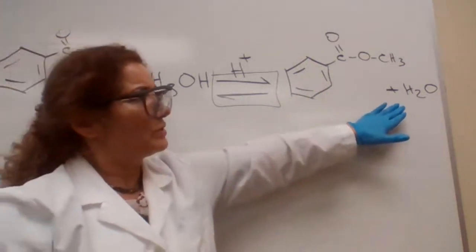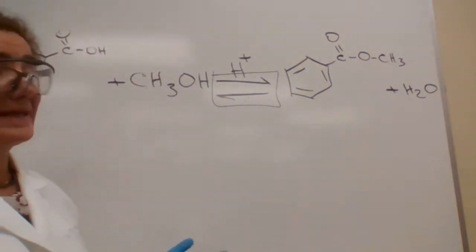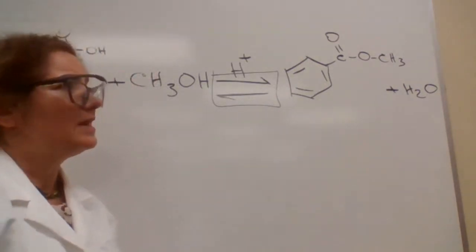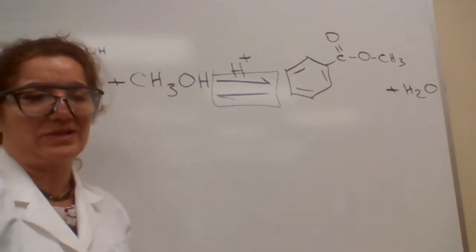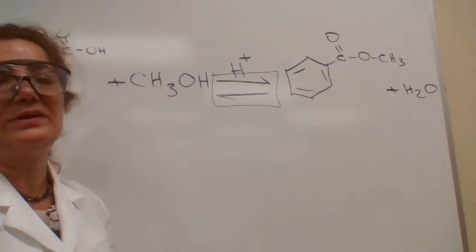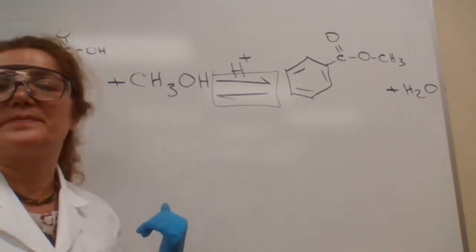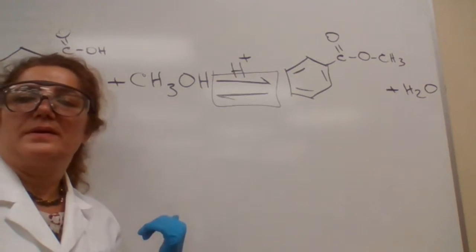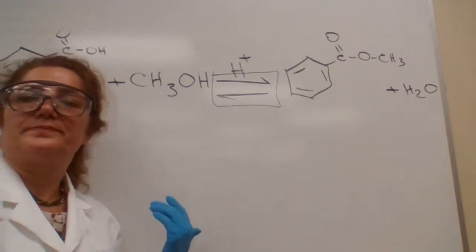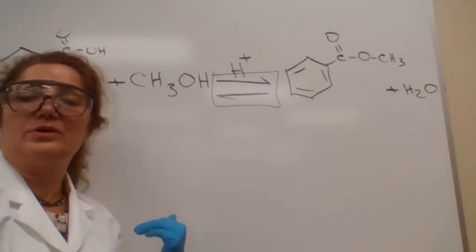One of the methods to remove the water is to apply heat to 100 degrees Celsius, which is impossible in this reaction. Why is it impossible to apply heat of 100 degrees Celsius in this reaction during the reflux? Any idea? Because it's a closed system.